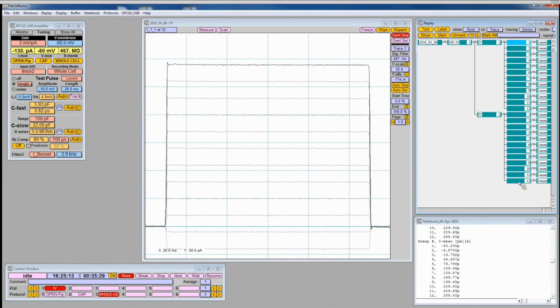And now you can see data are being recorded. Okay, this brings me almost to the end of this whole presentation, but I would like to show you quickly how to create a stimulus sequence, and how to do an online analysis with that newly created stimulus sequence.